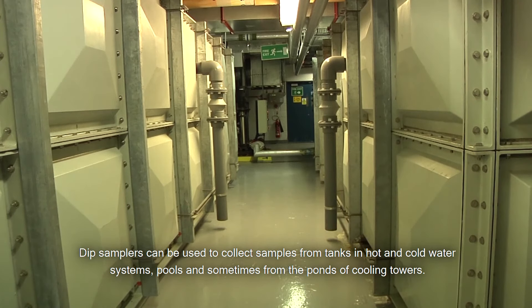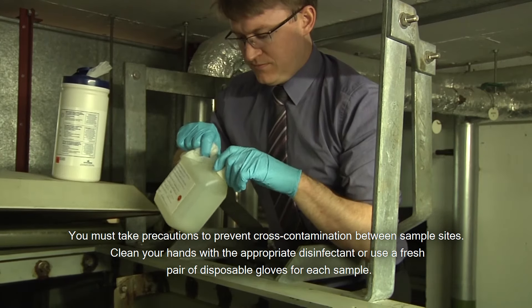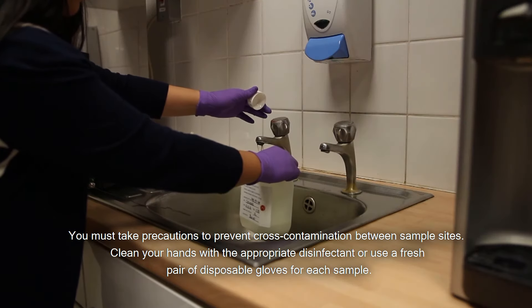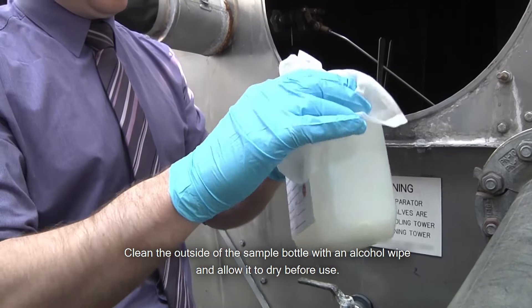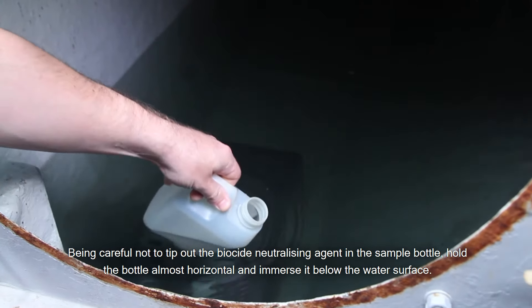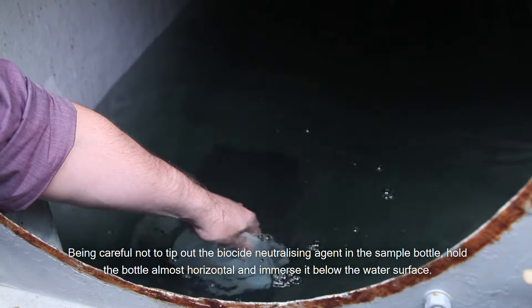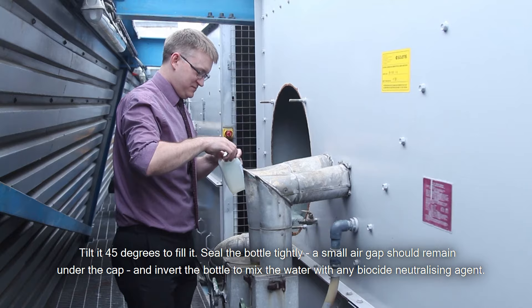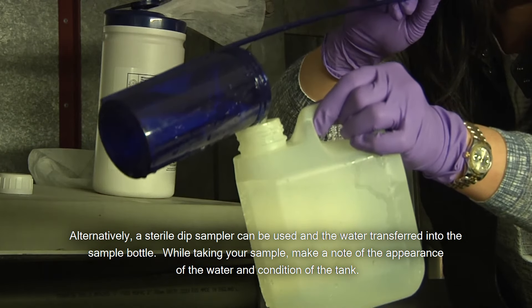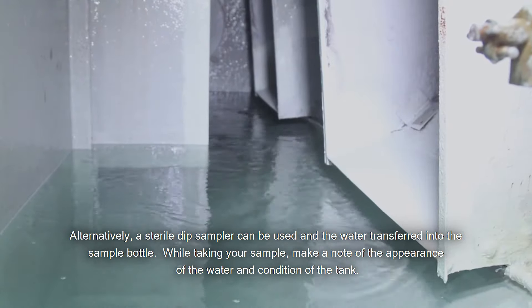Dip samplers can be used to collect samples from tanks in hot and cold water systems, pools and sometimes from the ponds of cooling towers. You must take precautions to prevent cross-contamination between sample sites. Clean your hands with the appropriate disinfectant or use a fresh pair of disposable gloves for each sample. Clean the outside of the sample bottle with an alcohol wipe and allow it to dry before use. To take a dip sample, remove the cap taking care not to touch the rim of the bottle. Being careful not to tip out the biocide neutralizing agent in the sample bottle, hold the bottle almost horizontal and immerse it below the water surface. Tilt it 45 degrees to fill it. Seal the bottle tightly — a small air gap should remain under the cap — and invert the bottle to mix the water with any biocide neutralizing agent. Alternatively, a sterile dip sampler can be used and the water transferred into the sample bottle. While taking your sample, make a note of the appearance of the water and condition of the tank.